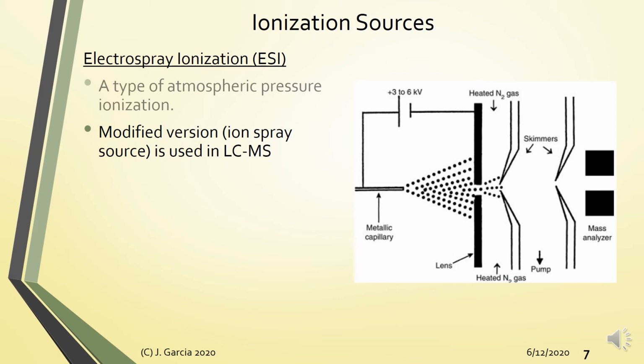So it is in solution phase. We need to have a method of first dissolving the analyte, and then introducing a very small amount of the analyte into the mass spec system. Electrospray ionization allows for that.